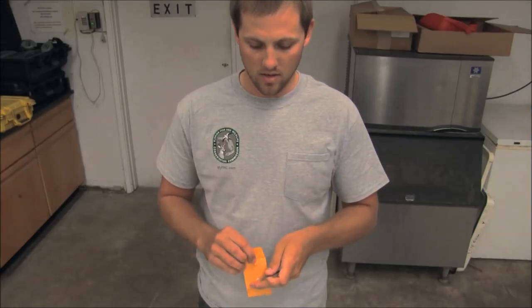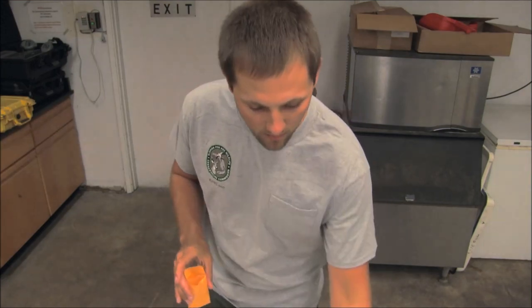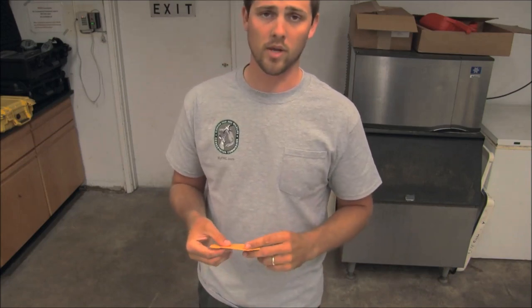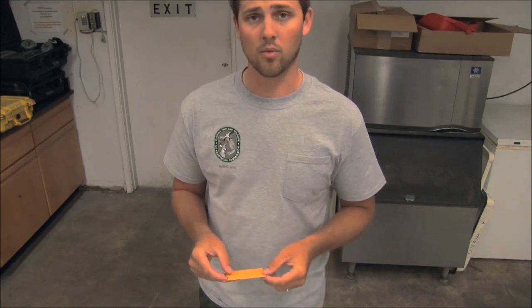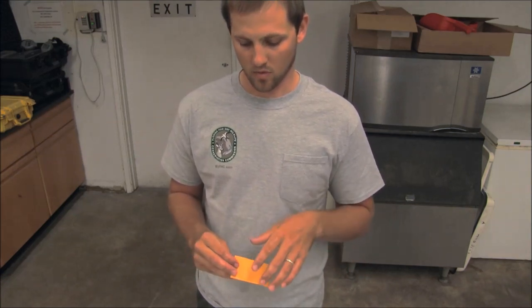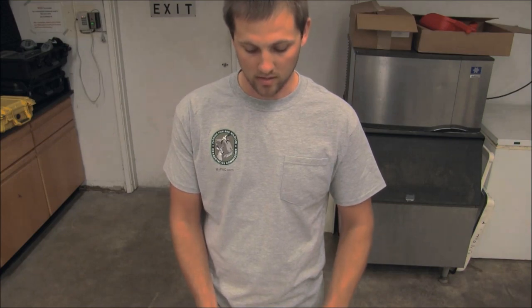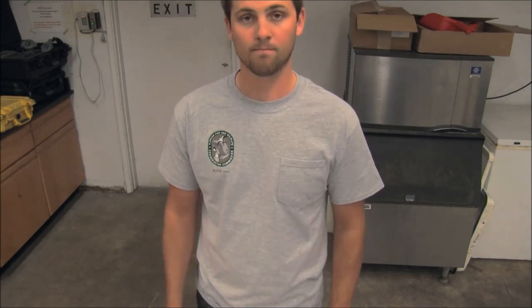Now we have our two clean otoliths. With smaller otoliths you might just use the back of your hand to clean them off. We'll put them in our envelope. Typically the envelope or vial is labeled with information like capture date, location, an identification number for the fish, and we have length and weight information correlated with this fish. And that's all it takes — definitely something that requires some practice just to get a hang of it, but it's not too difficult.